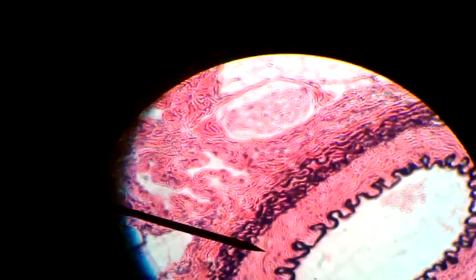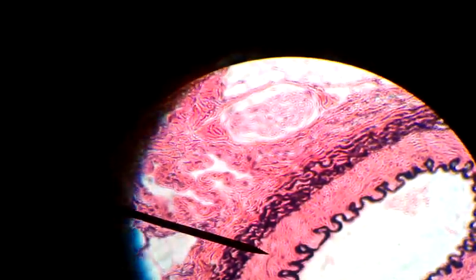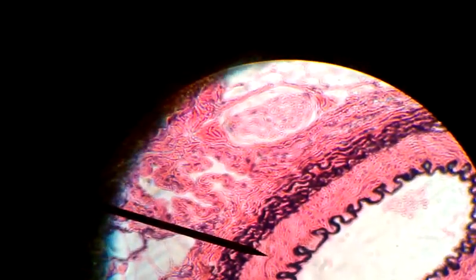So the lumen is the white circle. The dark squiggly line is the interna. The middle part, the pink, is the media. And the thick band on top is the externa. So just count out: lumen, interna, media, externa.